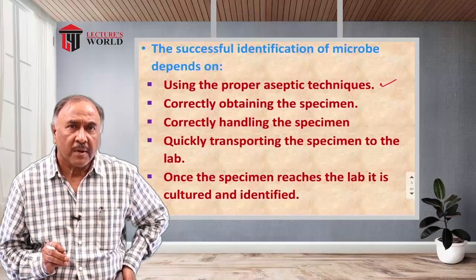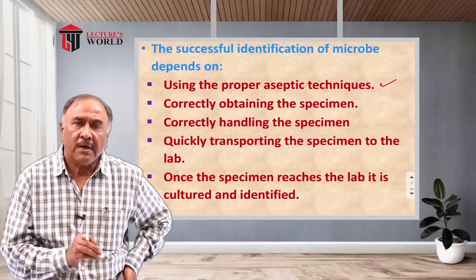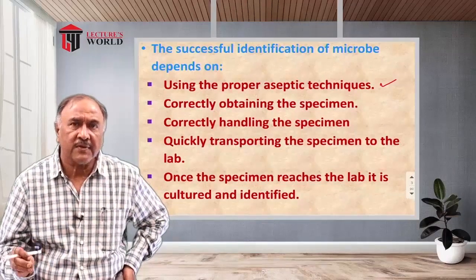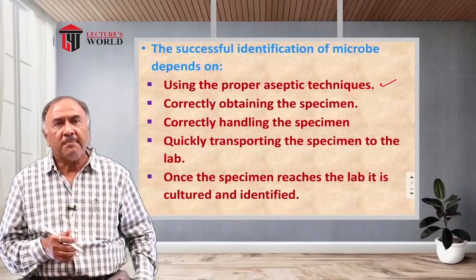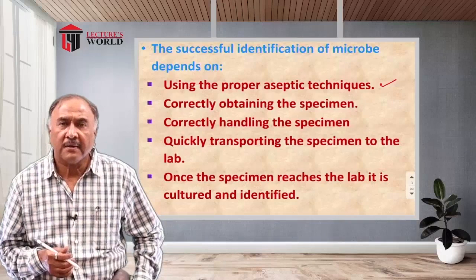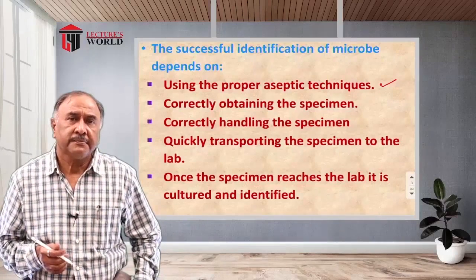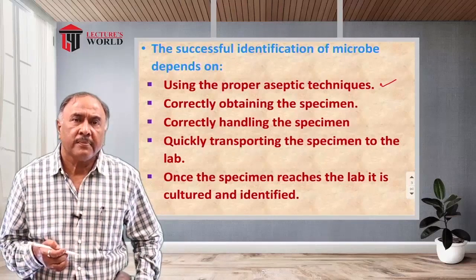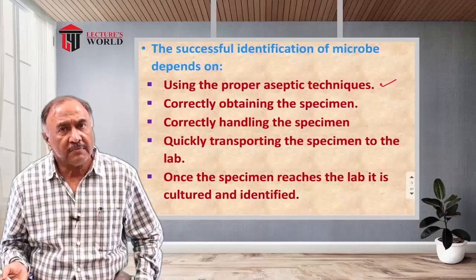Because if the sample is contaminated from exogenous sources, that is external sources, or endogenous sources, that is the host's own flora, then the pathogen may escape. Escape in the sense that the isolation of the pathogen becomes difficult. And if you cannot isolate and separate them in a purified form, then identification techniques will not be possible.